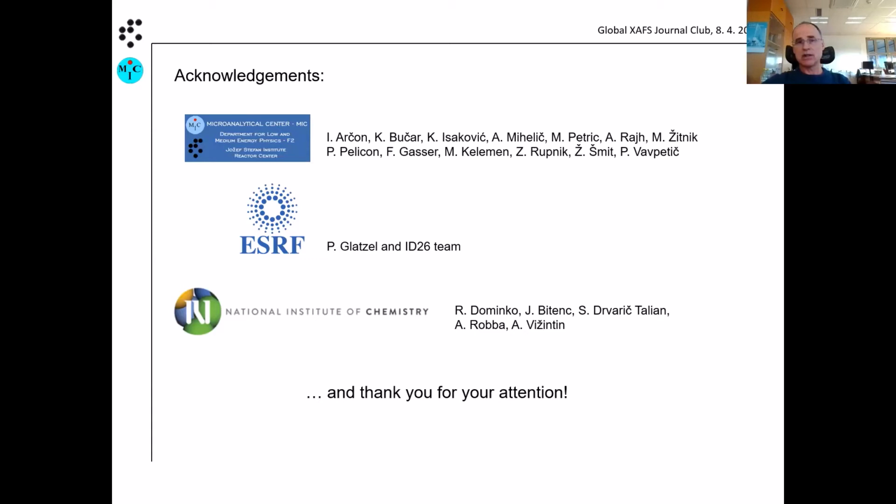But I think at the synchrotron, on the level of 100 or maybe a few hundred ppm, yes, we could do K alpha at least, so the core to core, and determine also the oxidation state or something similar as we have seen in mushrooms. On some mineral samples, the concentrations of sulfur were on the order of ppm, and it was possible to do such speciation. This is my best answer I can give.